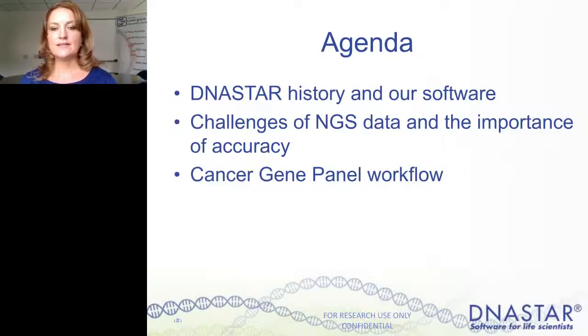So today I'm going to talk a little bit about DNASTAR history and our software, and then I'll get into working with next-gen sequencing data and the importance of accuracy. And then I'll get into a detailed workflow for cancer gene panel analysis.